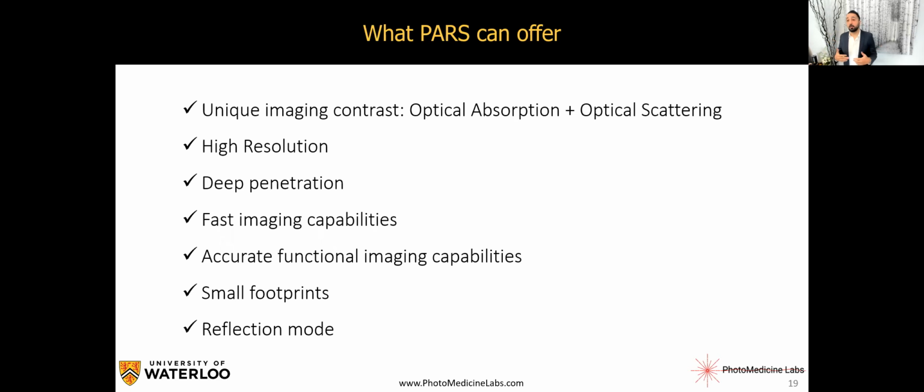In this case, because we do not really deal with sound propagation, we can improve our imaging speed by several orders of magnitude. Again, I cannot go deep in all of this. We can do very accurate functional imaging capabilities that I'm going to show you in the next slide. It's very important.